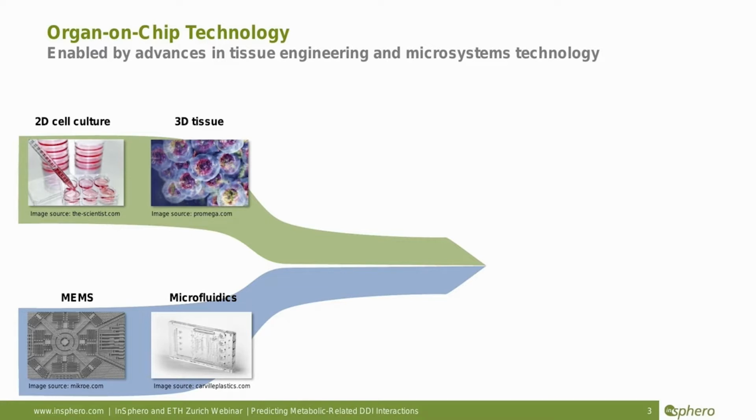The same technological processes have later been used also in microfluidics. So small microchannels have been structured in a substrate so that miniature amounts of liquid can be handled, which are at the same scale as you have it in the cells.